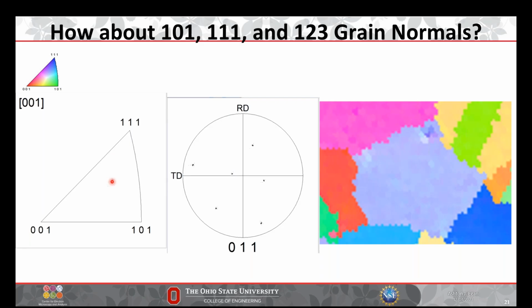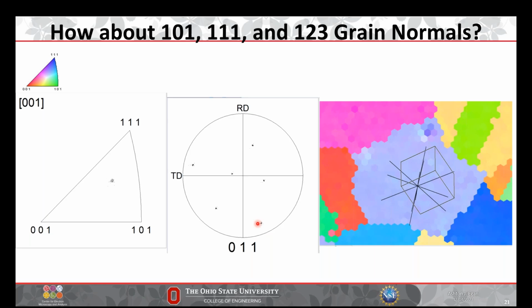And then, okay, well, I can't lay a platinum cap horizontal or vertical because we're a little off from both cases for where our 011 plane trace would be. So I like to know exactly what that angle is. And basically, there's no guesswork. You can just lay platinum right on here. And so this works out really, really well.